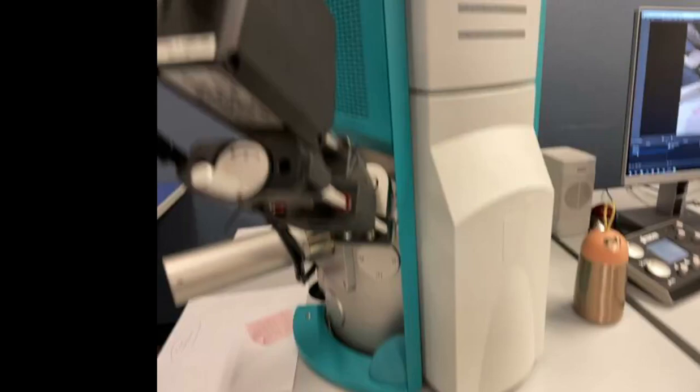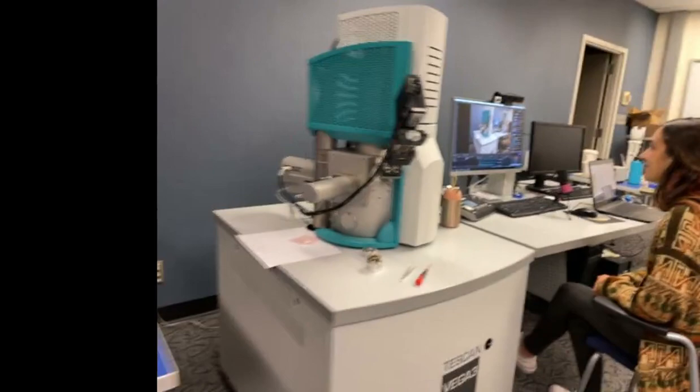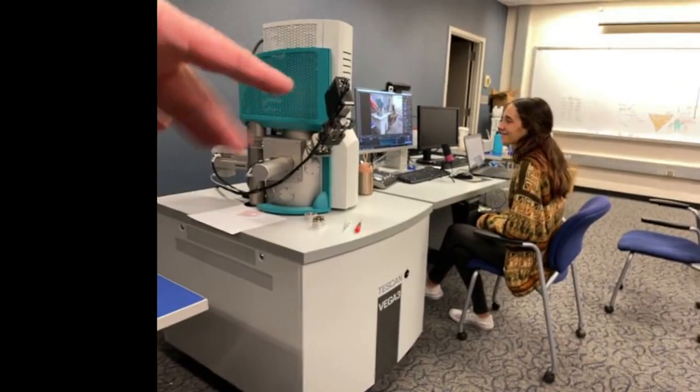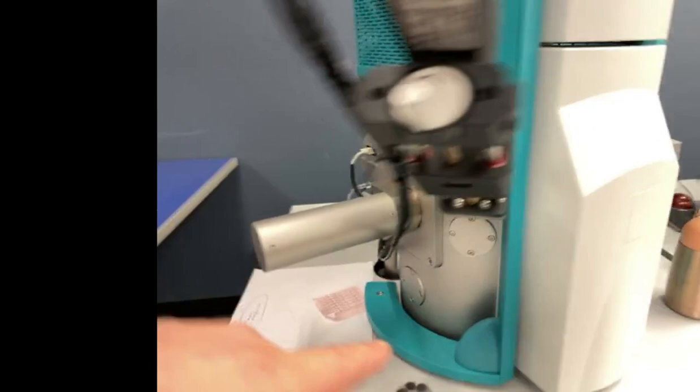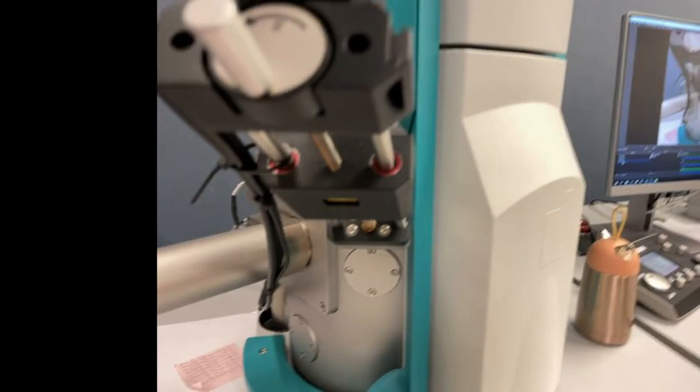And then this is the actual scanning electron microscope itself. I'll stand back and you can see Laura for scale. There's a desk that's kind of built into it. And then this is the elemental analyzer. This is the secondary detector, which is the thing that's drawing the picture for us. And this one is the camera that looks into the inside chamber, which we have off today. And this is like a drawer that opens up. Sometimes when we're taking samples in and out, I'll do this so you can see the whole process of us opening and closing it.